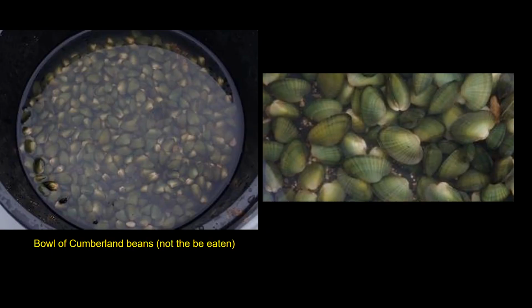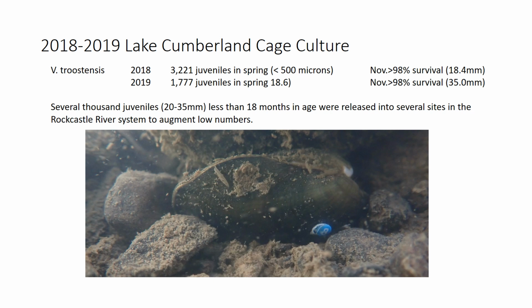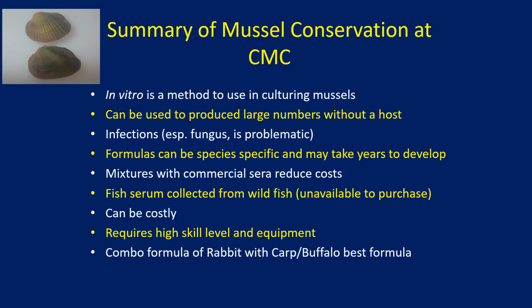Here's an example of about 500 Cumberland beans that came out of 1 cage, and these are just 5, 6, 7 months old, and they're already 15 to 20 millimeters. So very healthy juveniles with high survival. Just to give you an example, in a couple of years at Lake Cumberland, we were able to produce quite a few juveniles that we later used in mussel restoration, with very high survival. Here's an example of one of the ones that we released with the tag on it, to show that this can be done using in vitro culture and other methods.